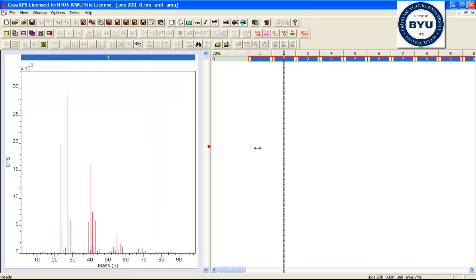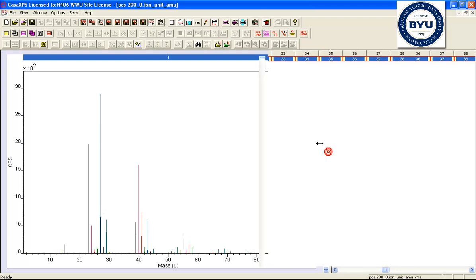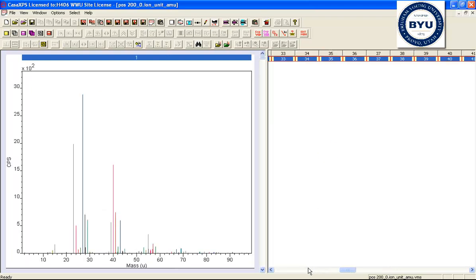So when we overlay all of these VAMAS blocks, we now see a time spectrum that has been converted to mass, and now we have a linear scale in terms of mass, and each one of these peaks actually represents a VAMAS block that we can look at individually rather than as a full spectrum.